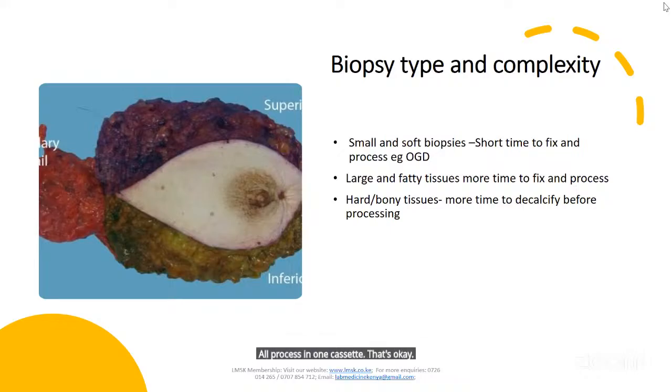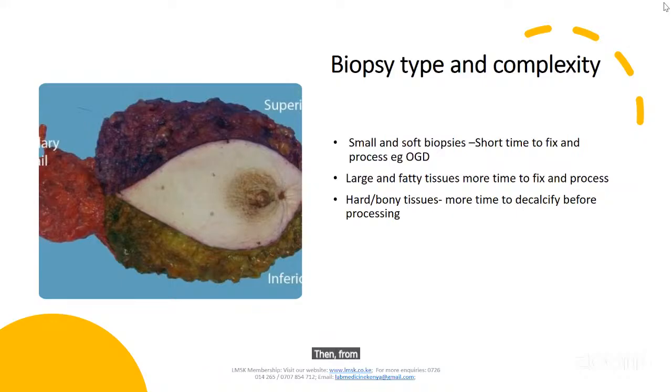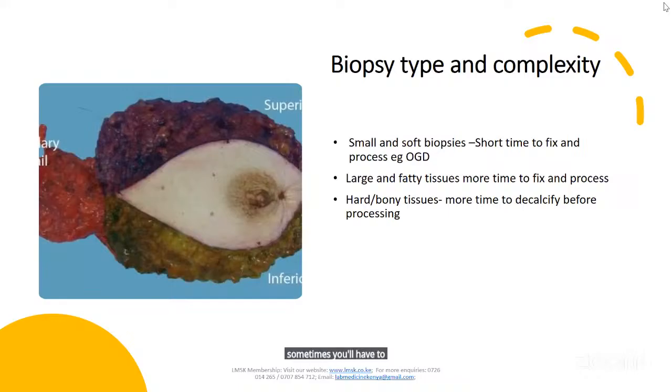For this one, you'll need to do it together with the pathologist, describing the margins, taking all the measurements, describing using the 5 C's. Then from there, sometimes they give it more time to fix so that it can be grossed the following day. Sometimes you'll gross it, but leave it for further fixation.